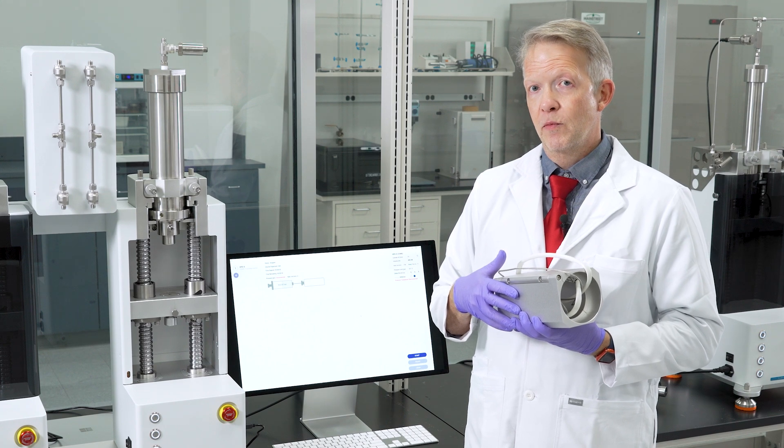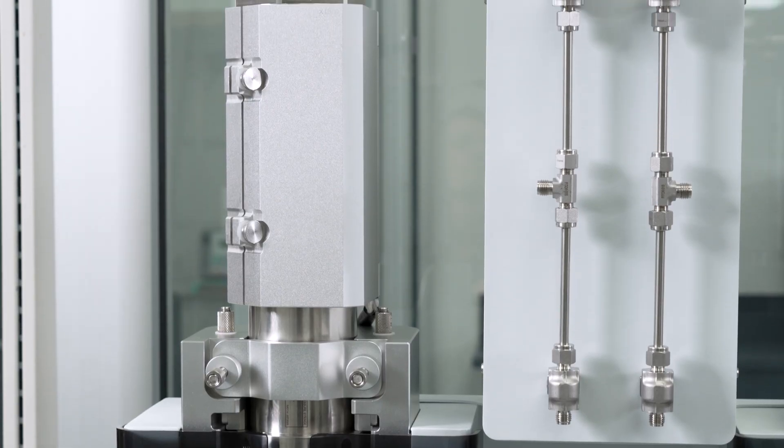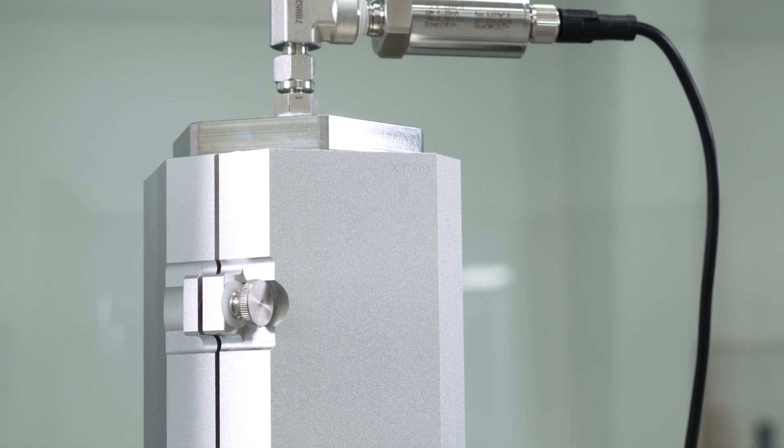The HP6 Syringe Pump supports heating sleeves for temperature control and sensors for pressure monitoring.